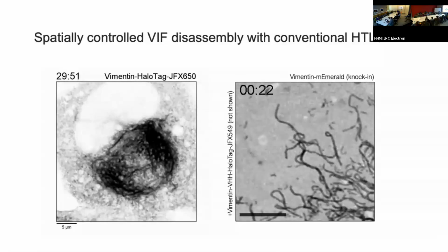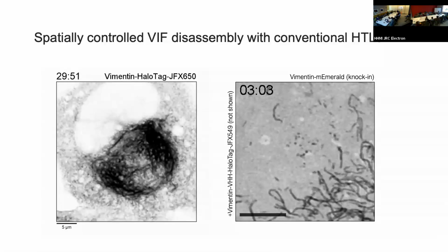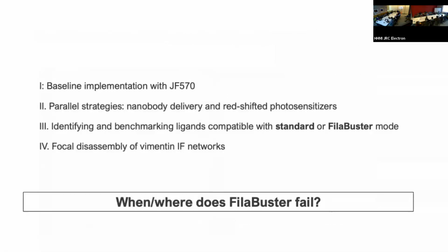But what hopefully this, jokes aside, comparison shows is the tool is robust and it could work for incredibly dense IF populations as well as for single filaments. It has the resolution to eliminate your entire network very quickly or target just one particular structure, say associated with the mitochondrion or ER, that you might want to query the effect of.